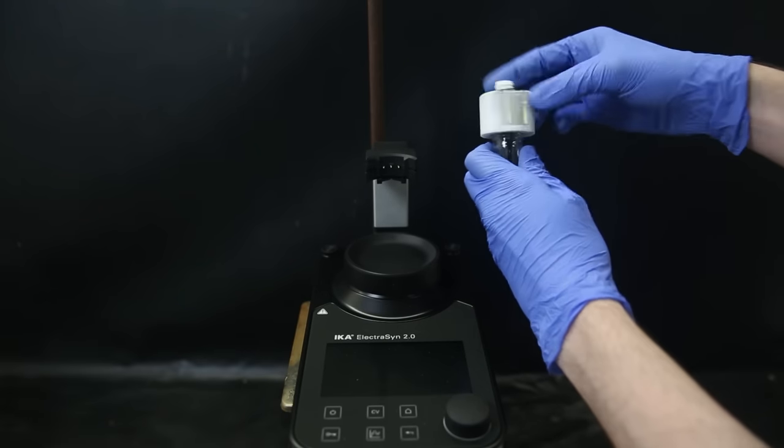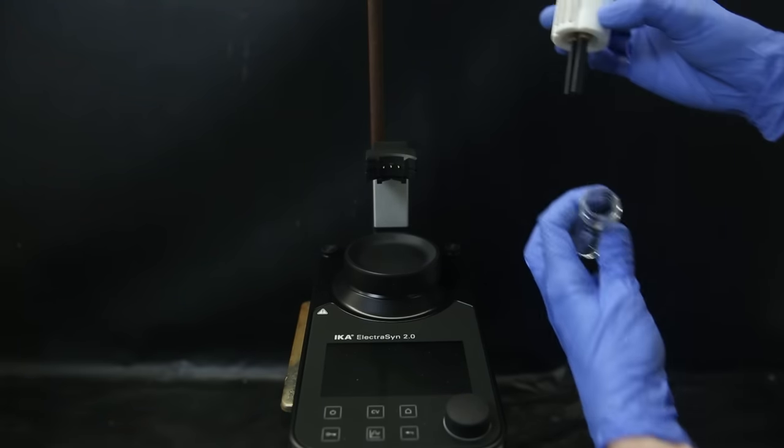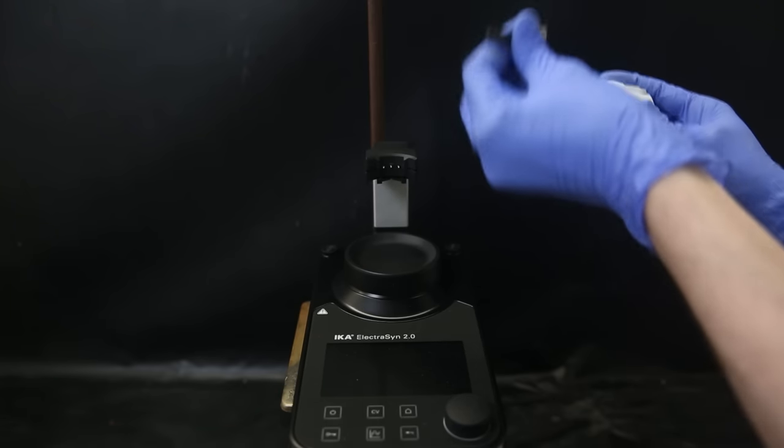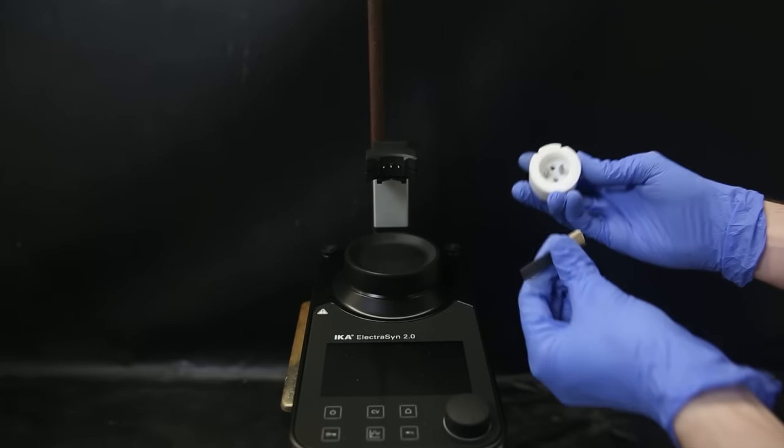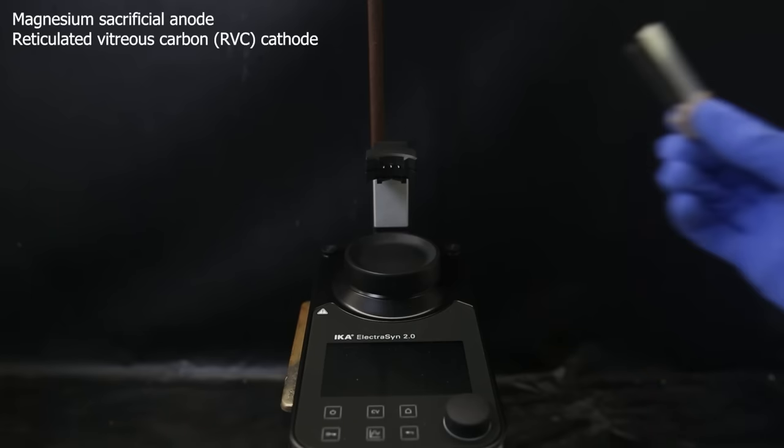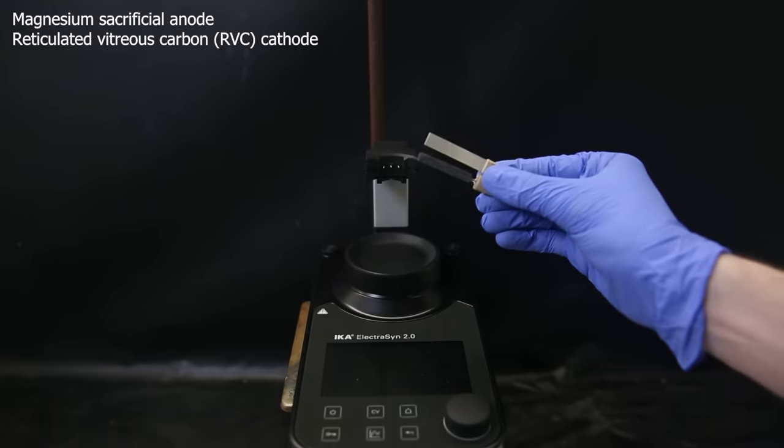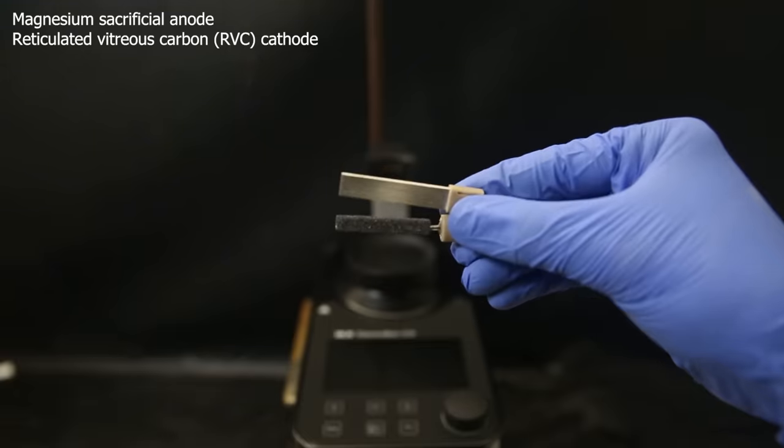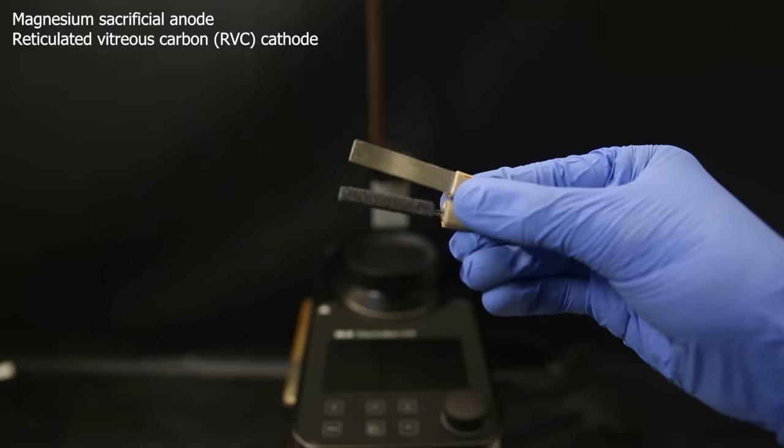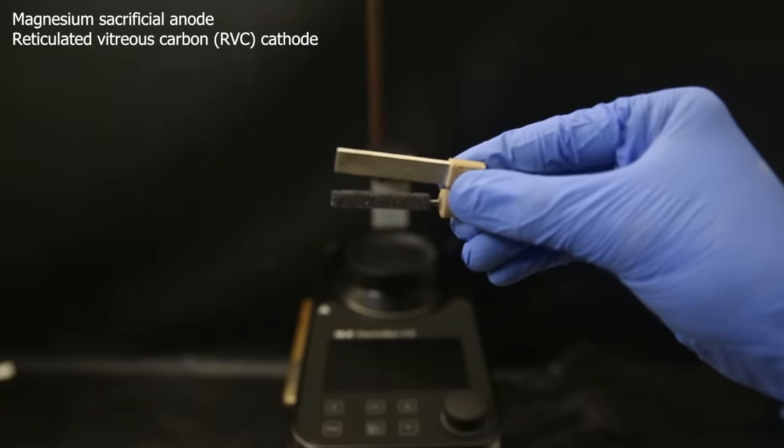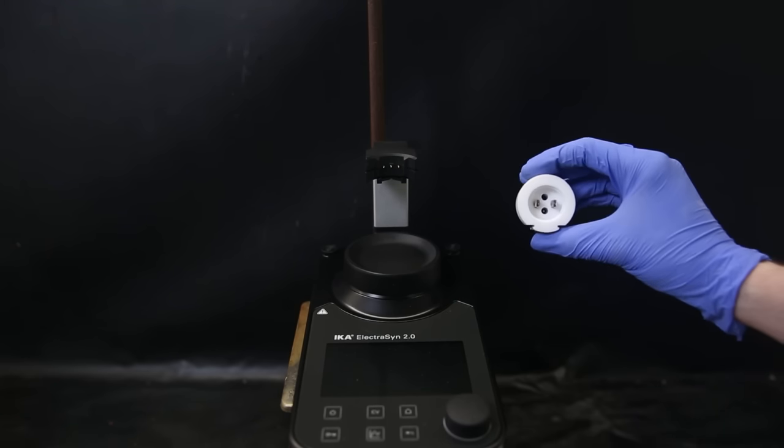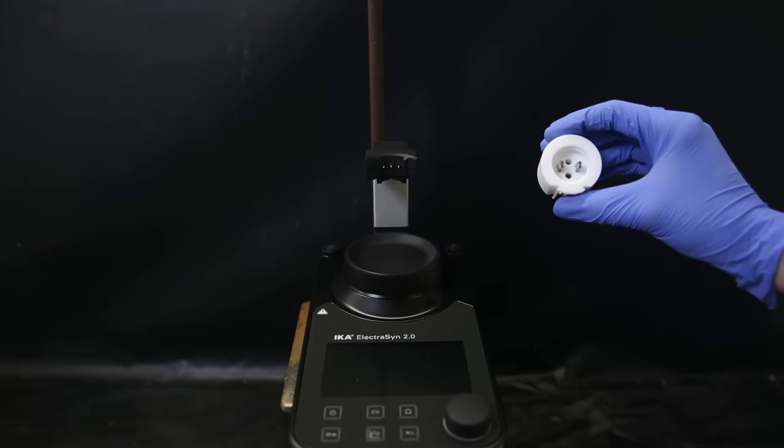The cap to which the electrodes are attached can be screwed off as well, and I have to replace the standard graphite electrodes to the ones I will need for this specific reaction. They just pull out of the top easily. The electrodes I will be using are a magnesium sacrificial anode and a reticulated vitreous carbon cathode, which is basically just porous glassy carbon. It's quite porous and also a little bit fragile. And the magnesium is just a metal stick. These electrodes are from ICA, but you can also attach your own into the clamps if they are cut to the right size.